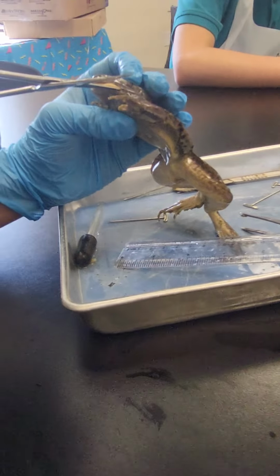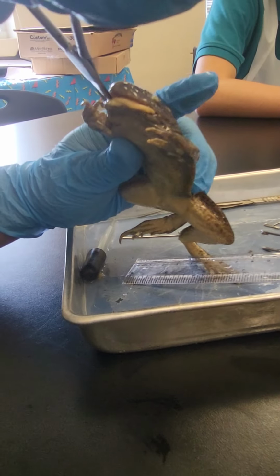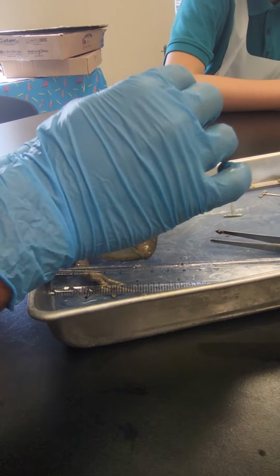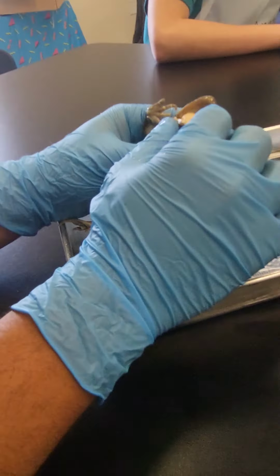Pry the frog's mouth wide open. Oh, God. The angles of the frog's jaw wide open. God, this is nasty. It smells horrible. That's exactly the same as the video. It smells horrible.